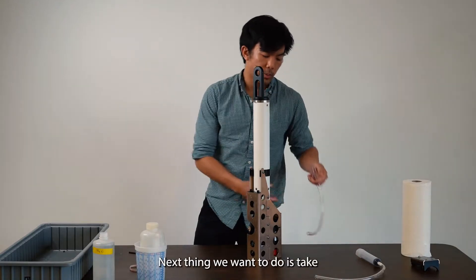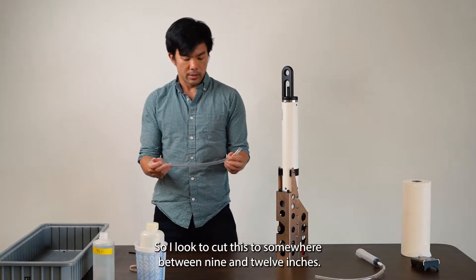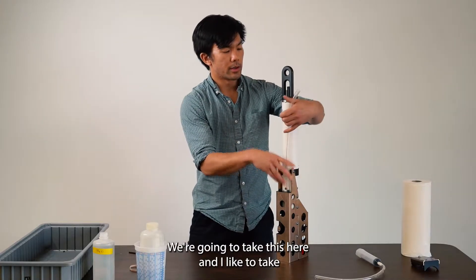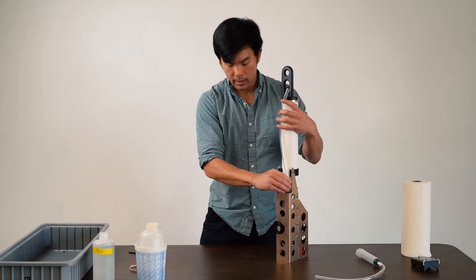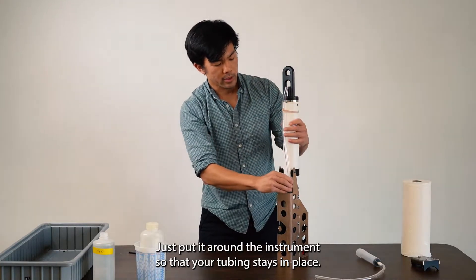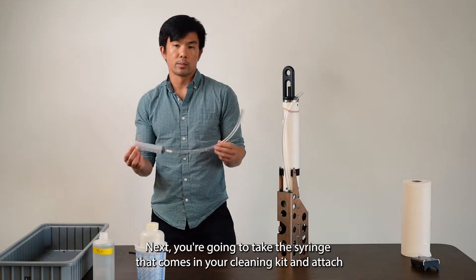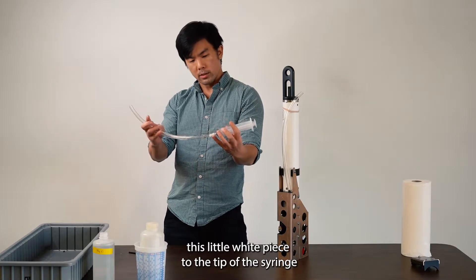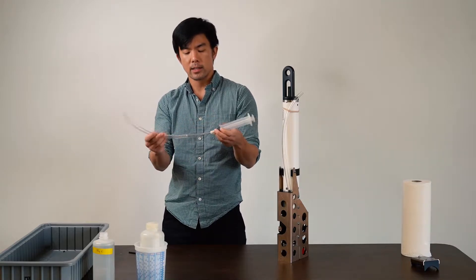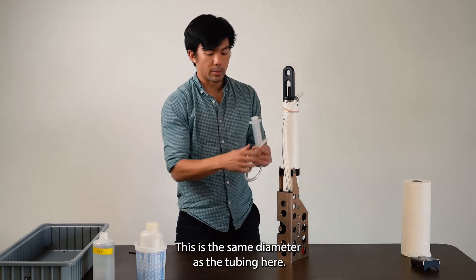Next, take the tubing from your cleaning kit and affix it to the hose barbs. I like to cut this to somewhere between 9 and 12 inches. I like to take a piece of rope or a rubber band and put it around the instrument so that your tubing stays in place. Then take the syringe from your cleaning kit, attach the small white piece to the tip of the syringe, put on the smaller diameter tubing, and feed that into the larger diameter tubing.